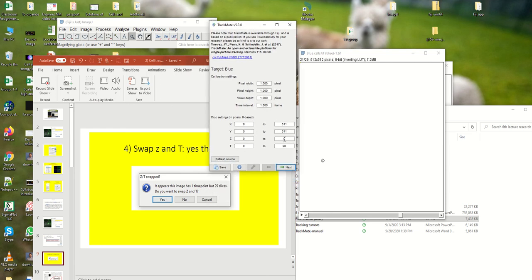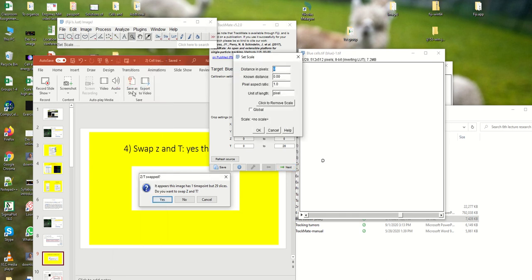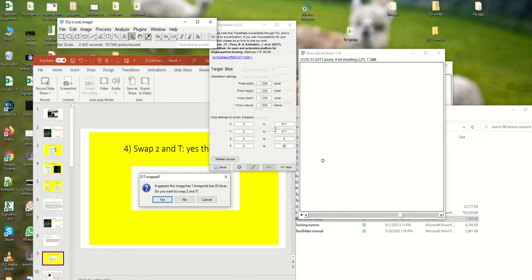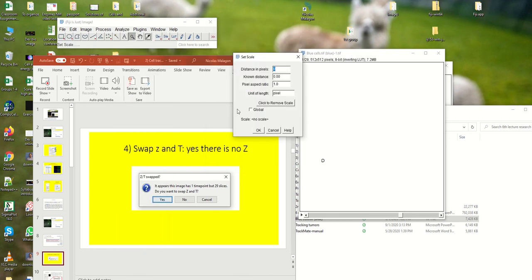Because we don't have 3 dimensions, this is just 2 dimensions, but we have the dimension of time. Here I think I forgot to set the scale. Look, I forgot to set the scale, so let's do it again in this 1, 3, 2.